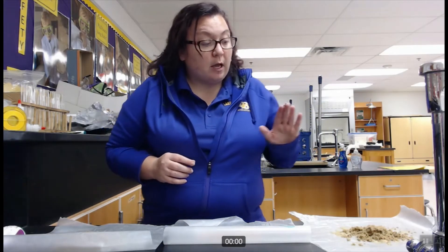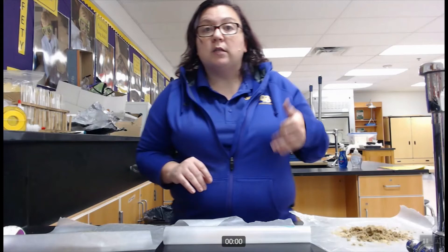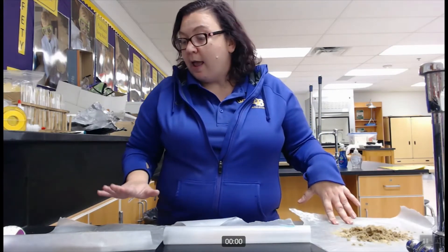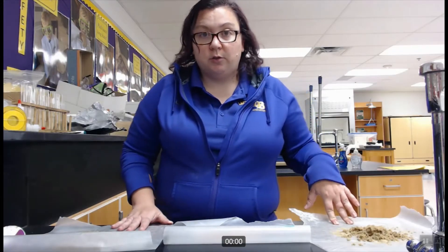What you'll be doing on your lab is: as I run through each soil sample, you'll be writing down your observations and working through the flowchart and identifying the type of particle. Here are two controls and then a sample from Virginia soil for us to identify.